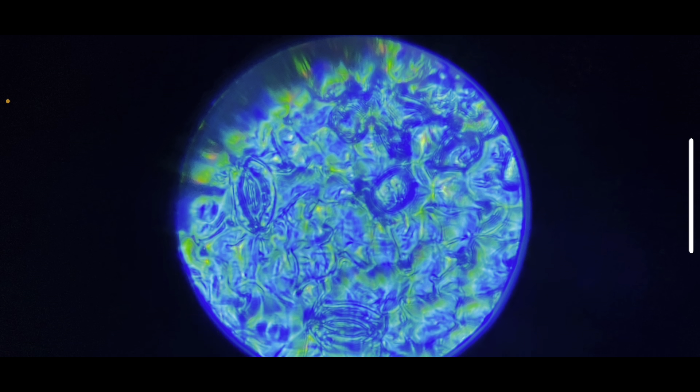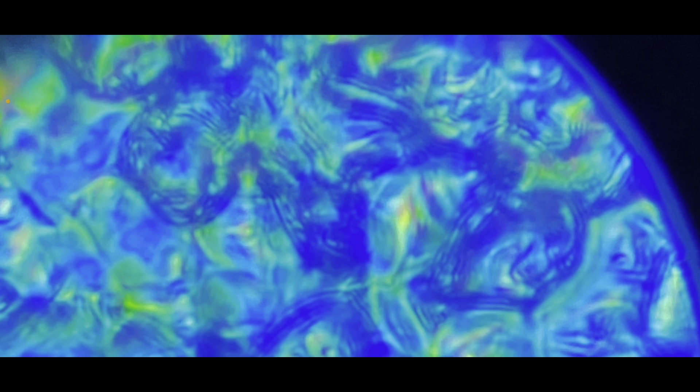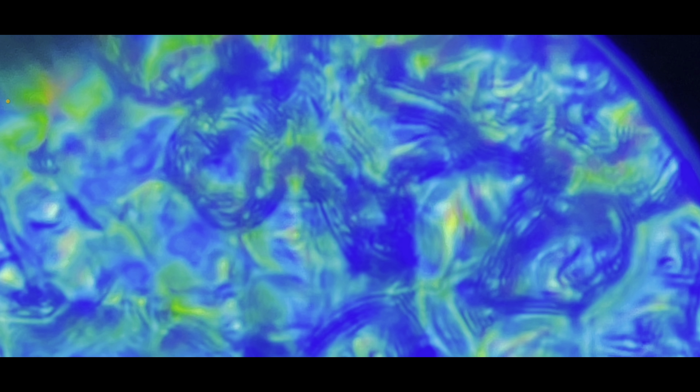Can we find a nucleus somewhere? I feel like these super dark and concentrated spots are the nucleus. What about metaphase — can we see metaphase? It's hard from just this one image because not all cells are represented. Maybe these straight lines are metaphase, but it's super unclear where the cell walls make the boundaries between each cell. We could assume that this is metaphase, although we're not totally sure.